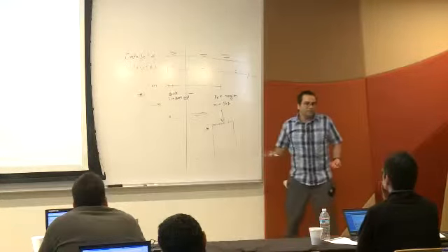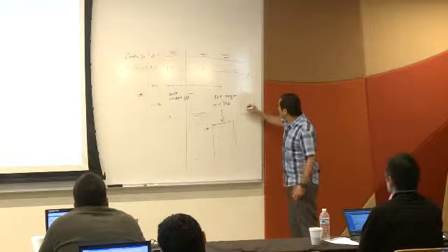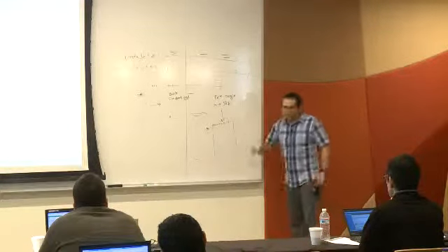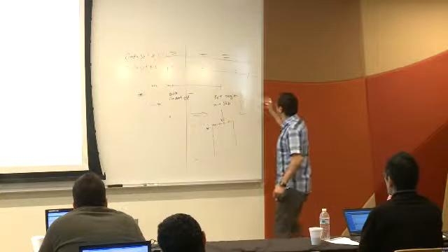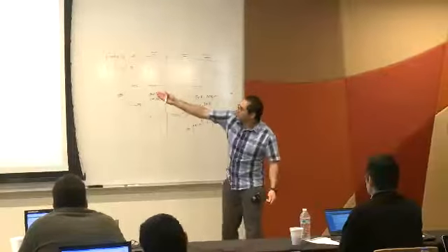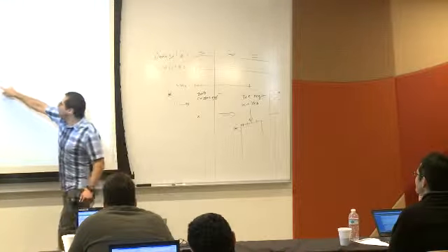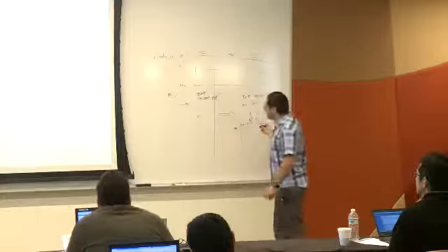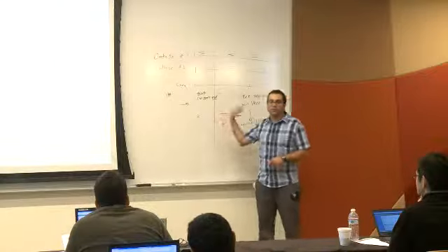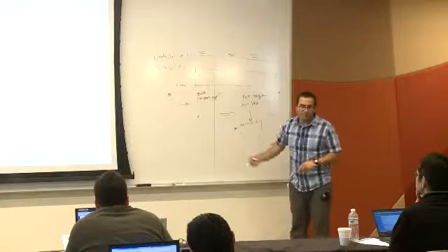And once we have that, we can, for instance, do a scatter plot that will tell us, OK, are they similar on all these genomic locations, where each dot can be something like what we would view over here. But it's going to be all over the place. And we can also make a correlation matrix if we use more than 2 data sets.